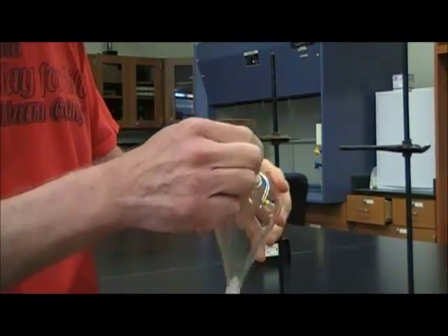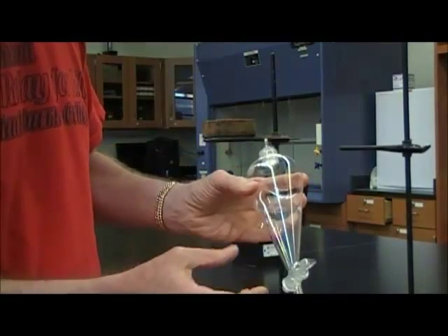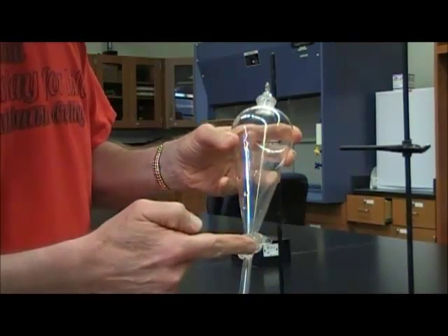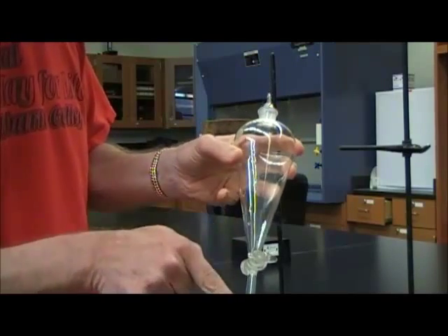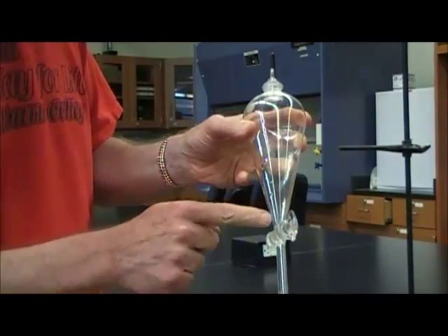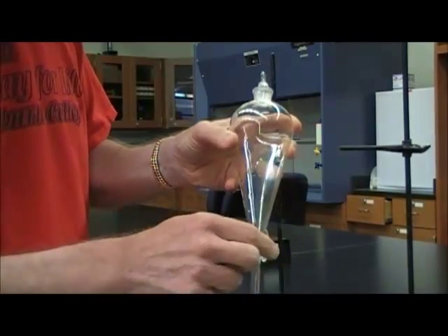Notice that it has a stopper, sort of a cone shape, and it has what's called a stopcock at the bottom. When the glass is across this way, then the stopcock is closed. And then when it's vertical, then there's a hole and the liquid can drain through.